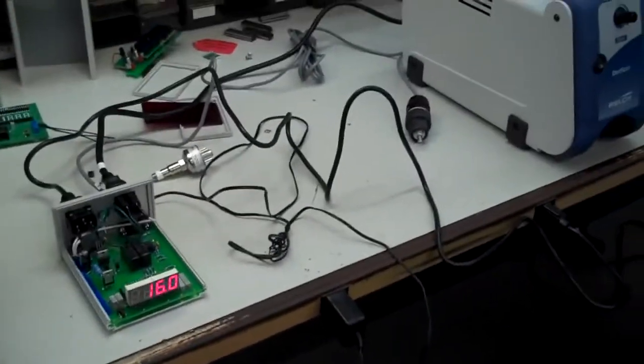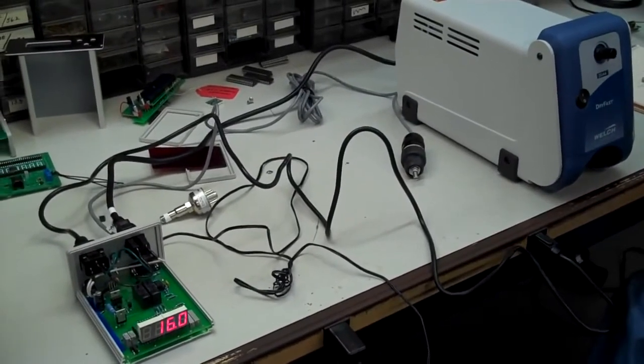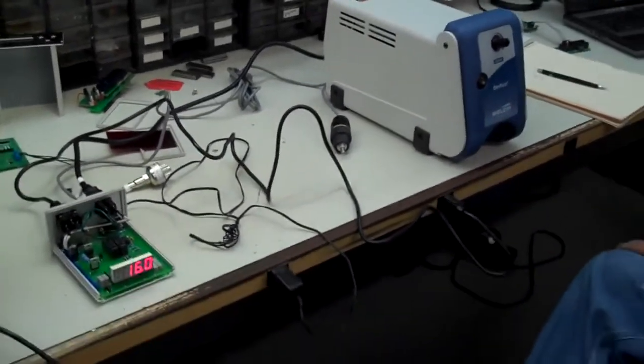Excellent. So you have a simulator there? We have a simulator. Of course, this instrument will be fully calibrated and tested prior to shipping.